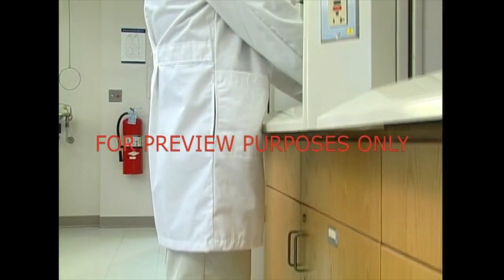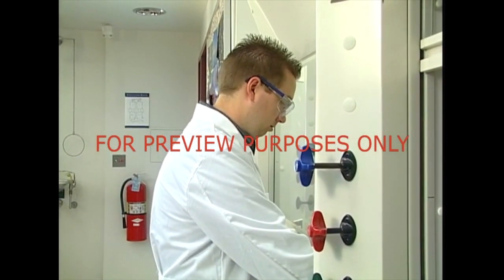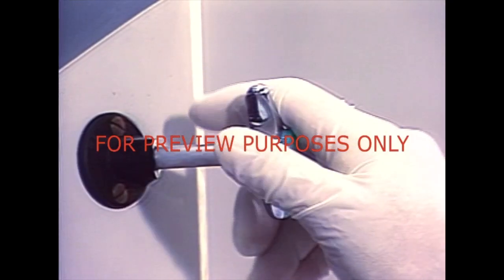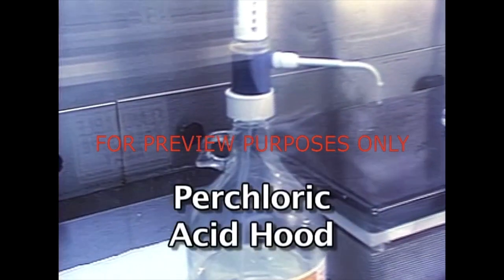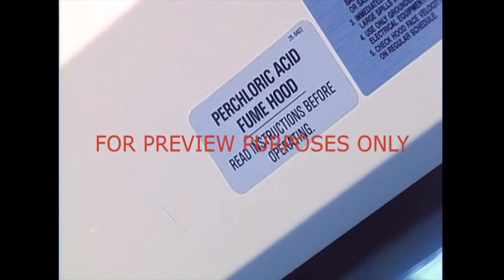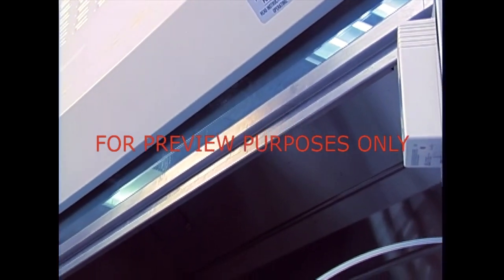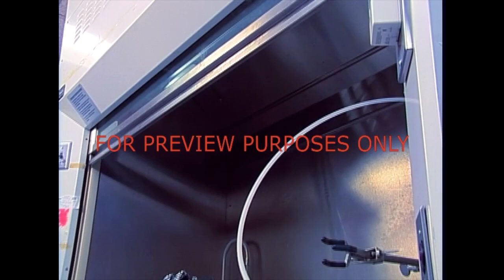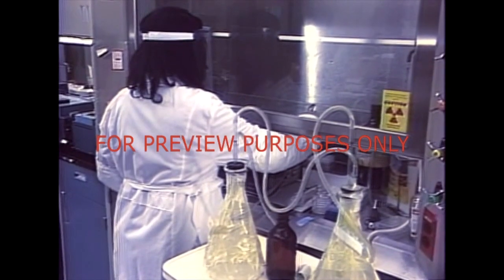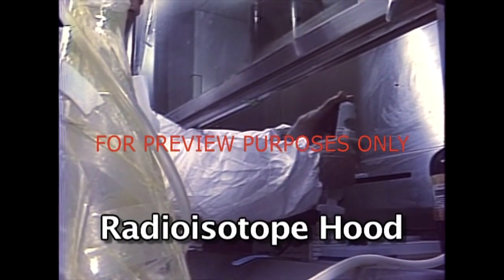There are hoods that provide protection against other specialized hazards as well. While you may not normally use them, you should know what they are there for and how they work. The most common of these hoods are used with perchloric acids and radioisotopes. The distinguishing feature of a perchloric acid hood is its washdown capability, which prevents the dangerous buildup of reactive residues. Organic materials should never be used in perchloric acid hoods, as an explosive reaction may result from the mixture of organics and the acid's residue. If you're working with radioactive material, you should be using a radioisotope hood, which is impermeable to radioactive material and will minimize dangerous exposure.